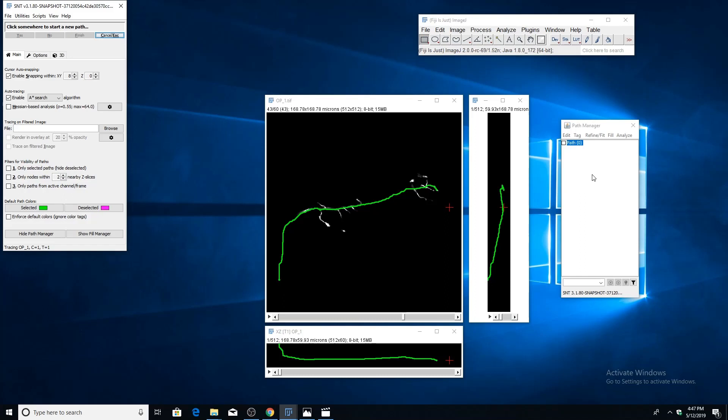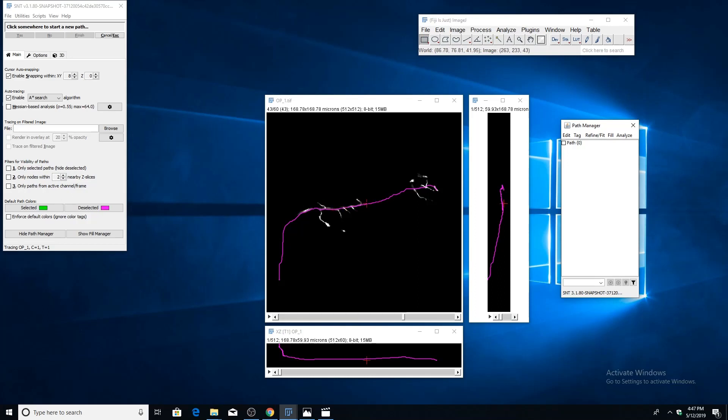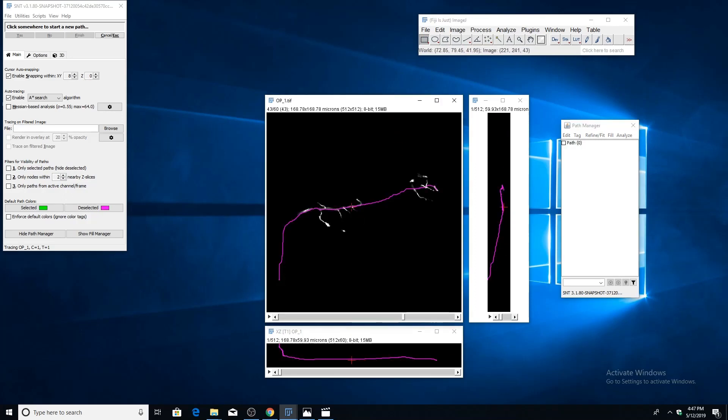I'm just going to show you how to select paths. I'm going to deselect it by clicking somewhere in the path manager. You'll see that it's turned purple, which means it's deselected. To select paths, you can either click on them in the path manager, or you can press the G key while your cursor is near the path, and it will select the nearest path.